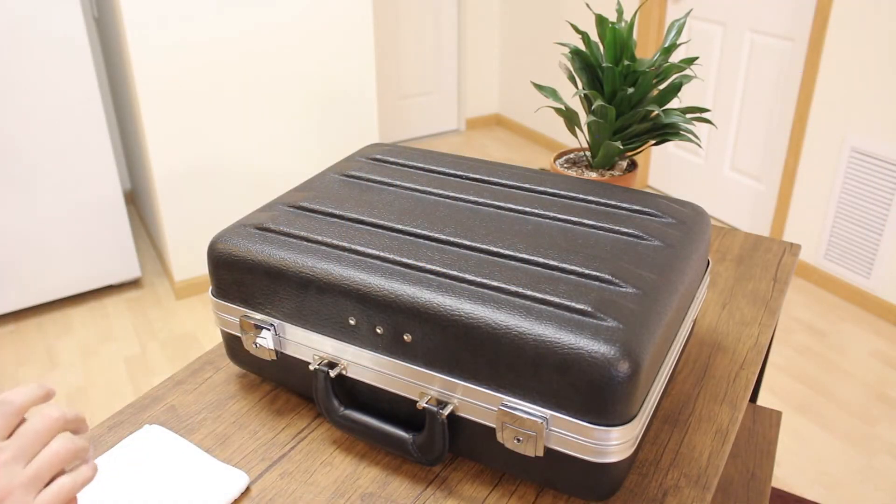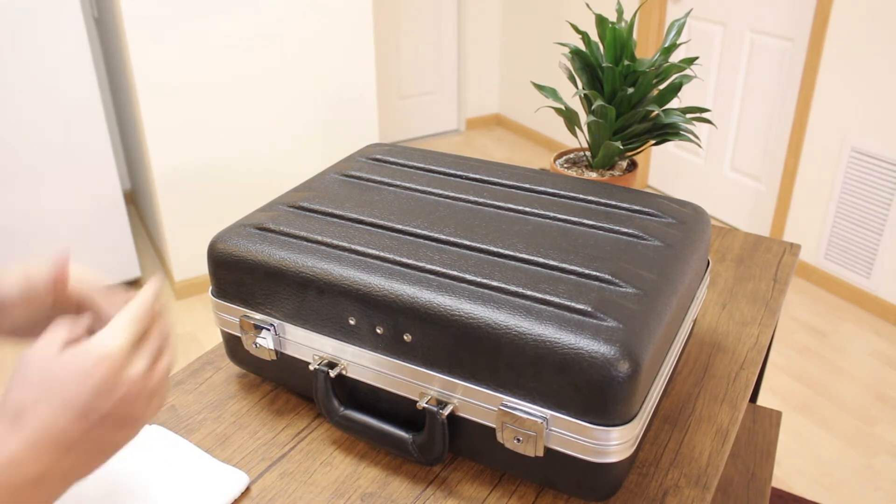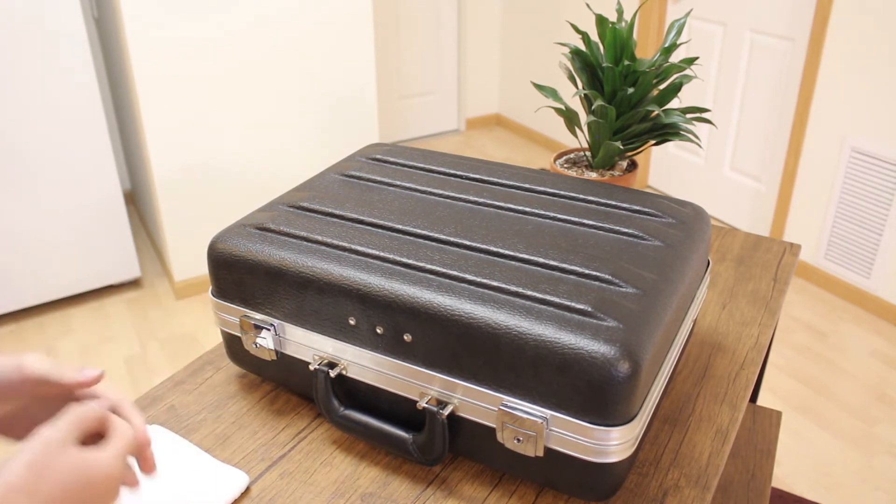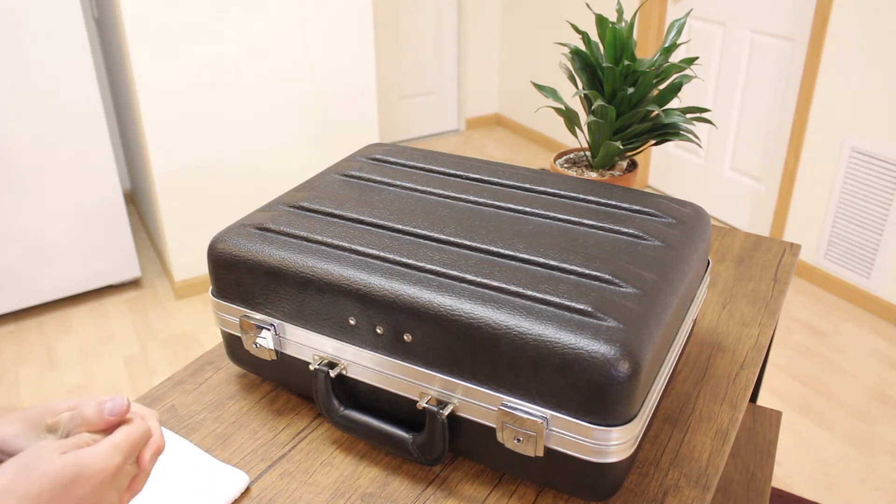We do sell this kit on our website. We actually sell the silver, gold, and platinum kit. This is the platinum — it's the higher-end case for good reason. Right off the bat you can tell it probably looks a little different than most of the cases that we see out there.